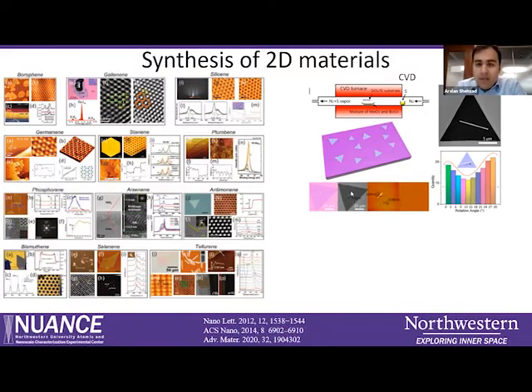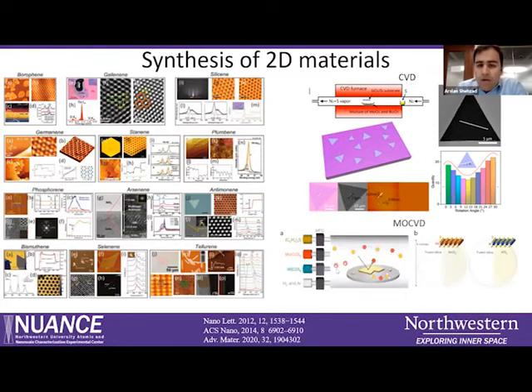More recently, people have been working on metal organic CVD, where you can use all these precursors, because these are pyrophoric precursors, so you need to be extra cautious. You need to have a specific system for that, a scrubber, before you expose it to the air. That's why most of the industry has been using it from the research perspective. We have not used it. You need to have an ultra high vacuum to control this. That's why most people have been advancing their MBE setups to MOCVD setups.